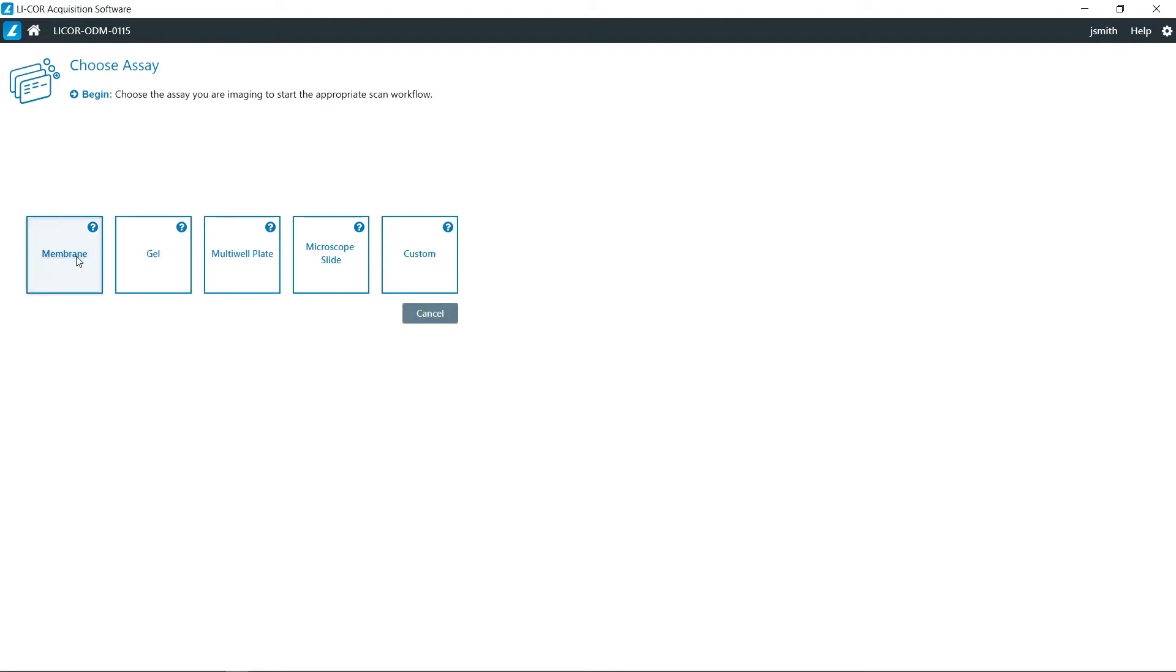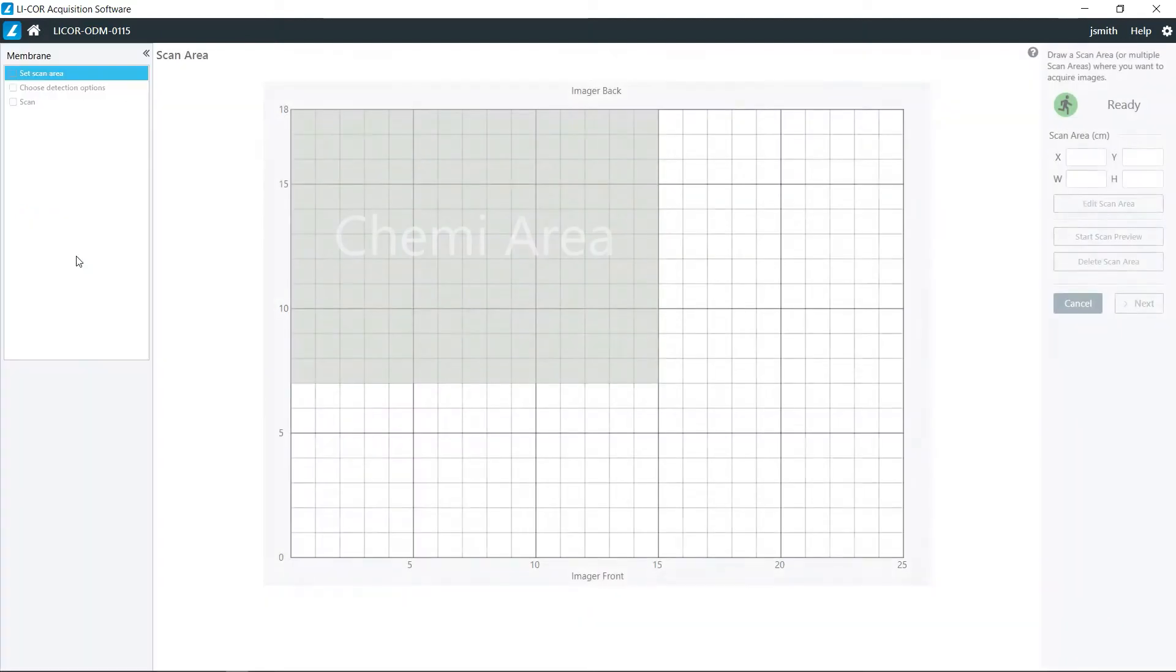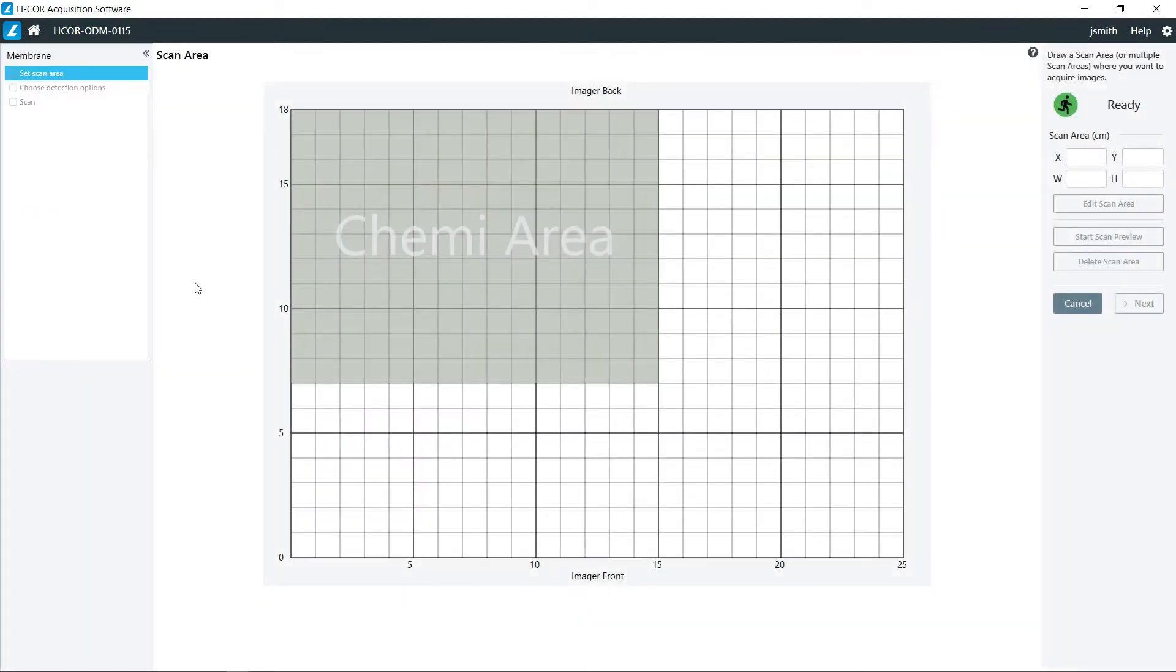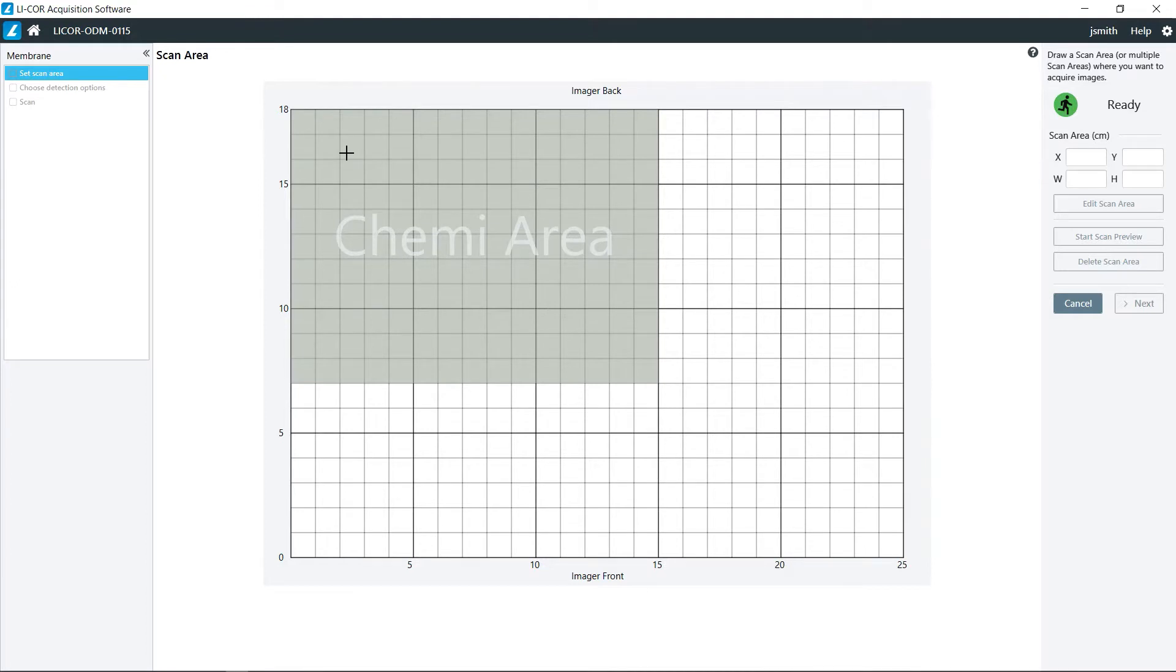We're going to choose membrane from the list of assays. Now if you are doing a chemiluminescent blot, that does have to be positioned towards the back left corner on the scan bed.